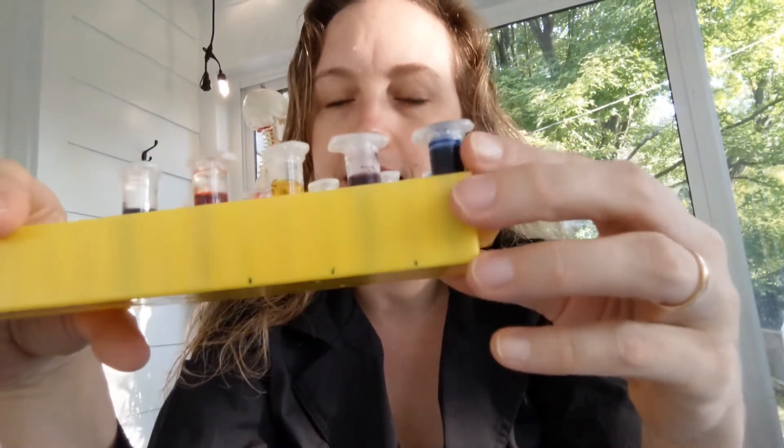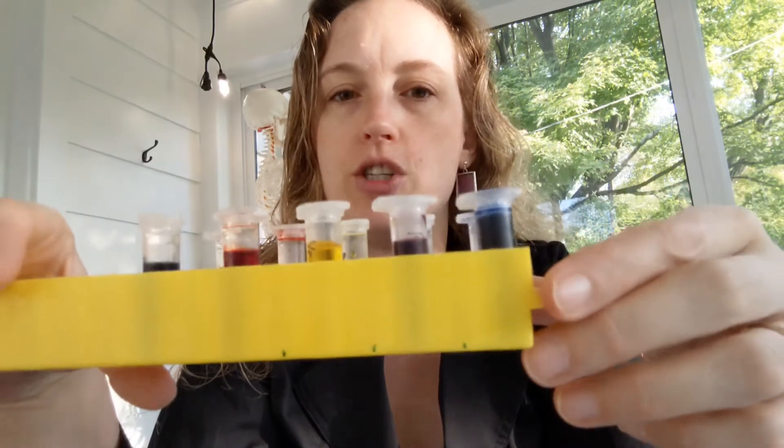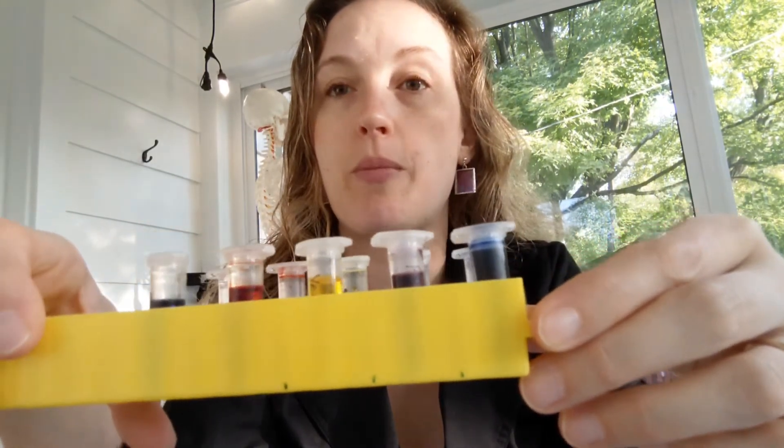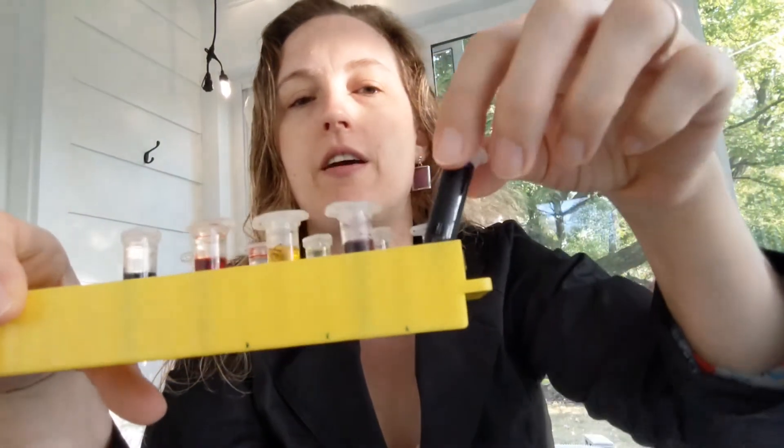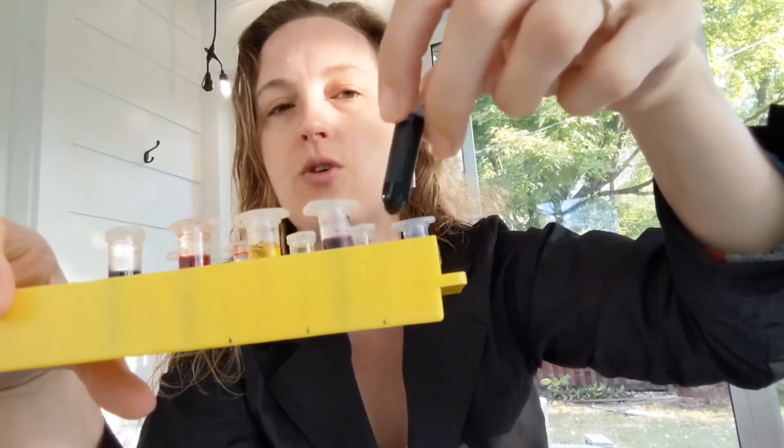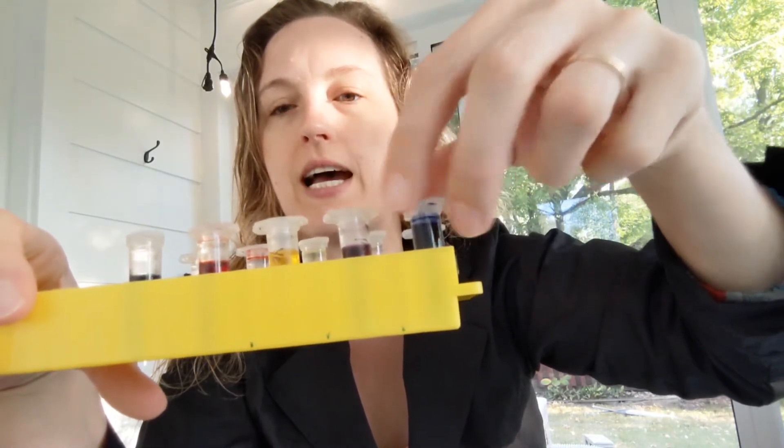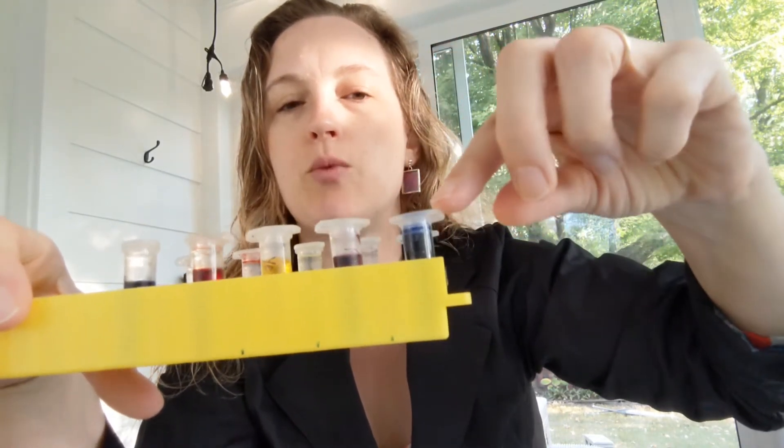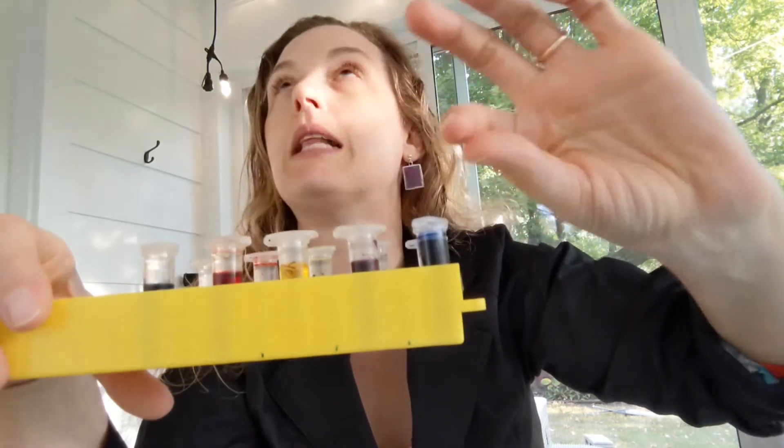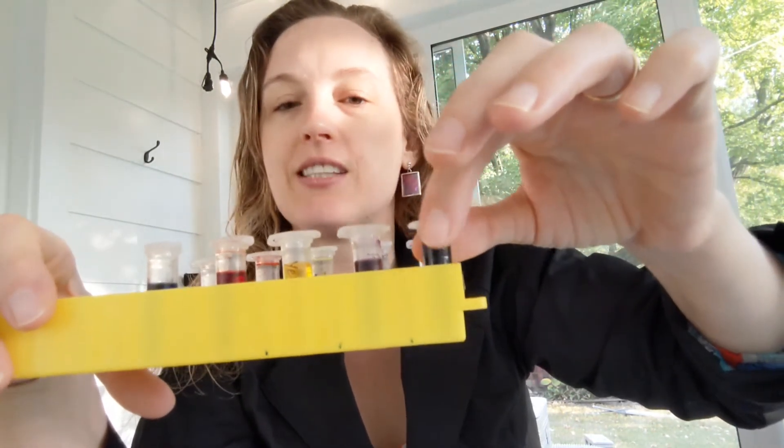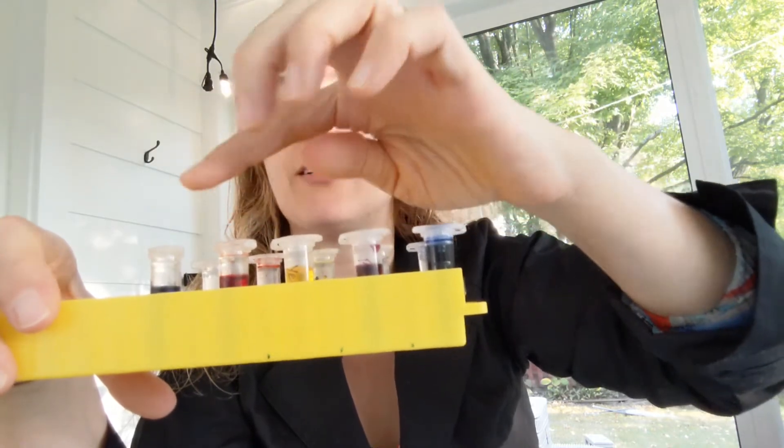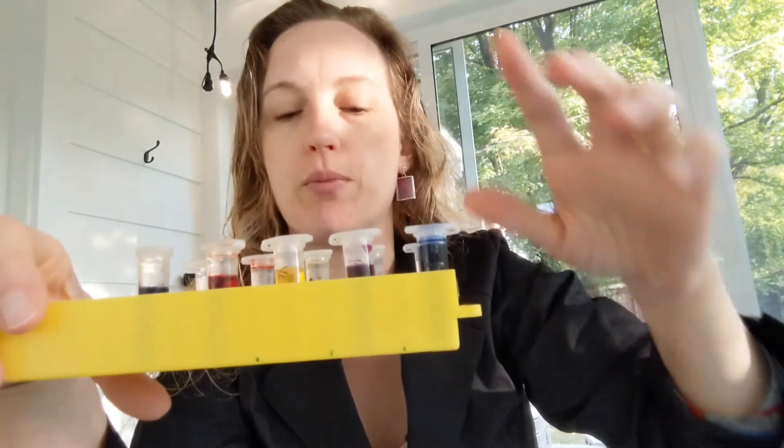You just aliquot your dyes into these. It was easy to just use a plastic graduated micropipette to save time. They're also graduated on the side. So you can estimate there's more than enough dye to fill them. Each team will need two milliliters of navy and 1.5 milliliters of blue, red, yellow, and purple.